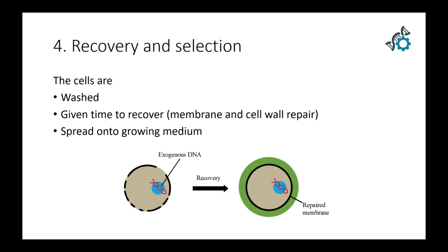Finally, we need to recover the cells, and we do that by washing away all these chemicals, especially the lithium, which is toxic to the cell. It is not healthy for it to be in contact with lithium for so long, so we need to rinse that away.